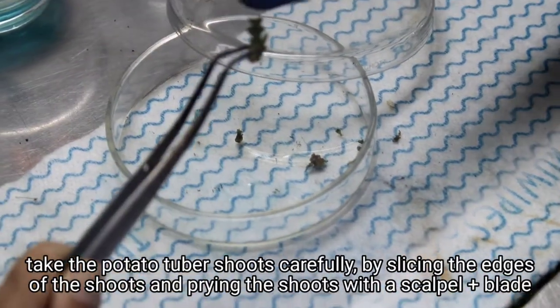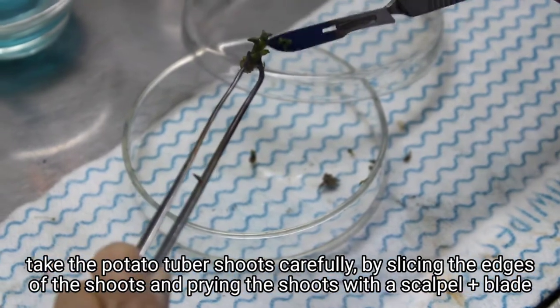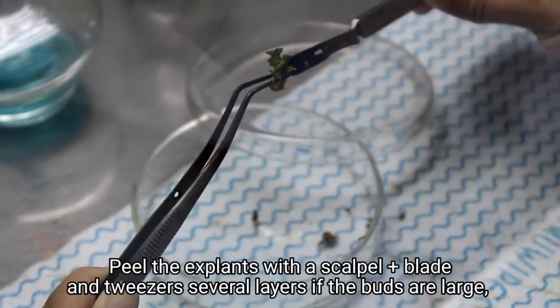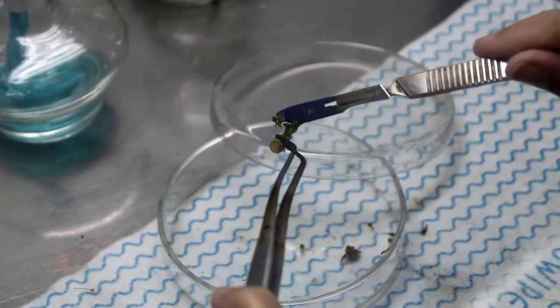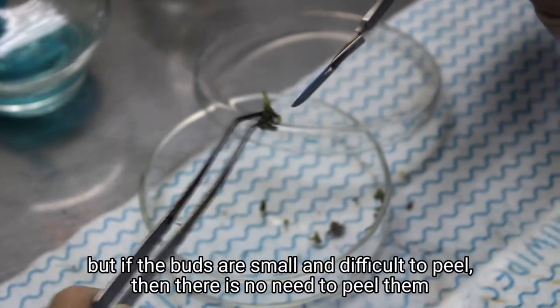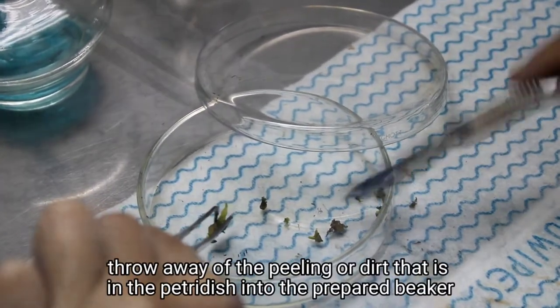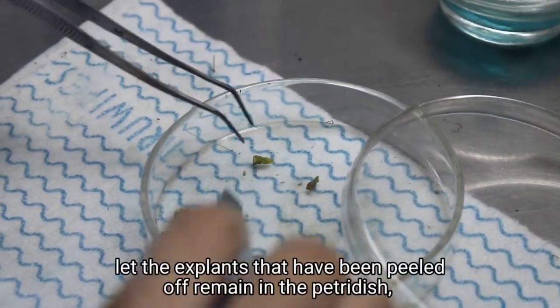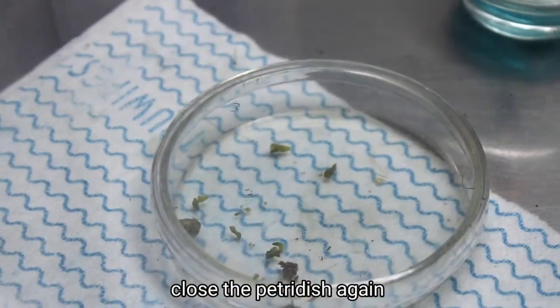Take the potato tuber shoots carefully by slicing the edges of the shoots and prying the shoots with a scalpel blade. Peel the explants with a scalpel blade and tweezer several layers if the buds are large. But if the buds are small and difficult to peel, then there is no need to peel them. Discard the peelings or dirt from the petri dish into the prepared beaker. Let the peeled explants remain in the petri dish, then close the petri dish again.